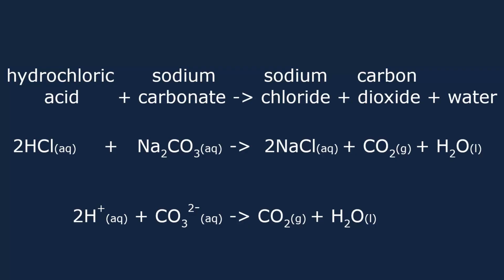Effervescence is observed due to the reaction of a carbonate ion with two H+ ions to give carbon dioxide gas and water. This can be seen in the ionic equation at the bottom of the screen. In this example we use sodium carbonate, which is aqueous. However, most carbonates are solid. If the carbonate you are testing is solid, remember to change the state symbol for the carbonate-containing compound and the CO3 2- ion in the ionic equation from aq to s.